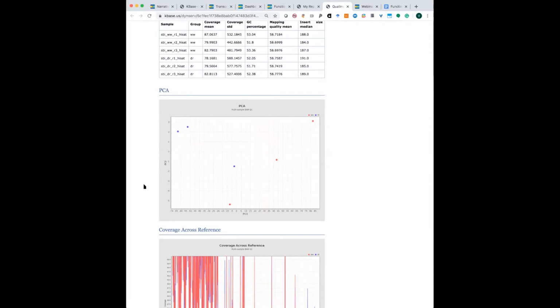The first principal component, which captures the majority of the variation, is really what you want to look at. And then to some degree, you want to look at your second principal component, which captures the remaining variation. Obviously, there are additional principal components which capture the leftover variation, but these 2 capture the majority of it, and PC1 captures the most.